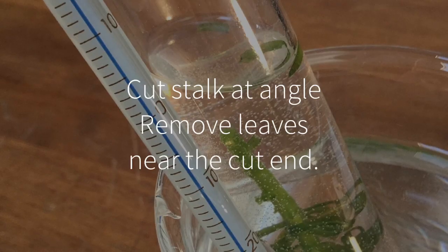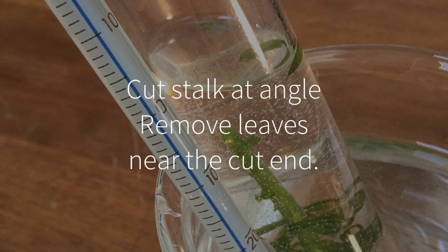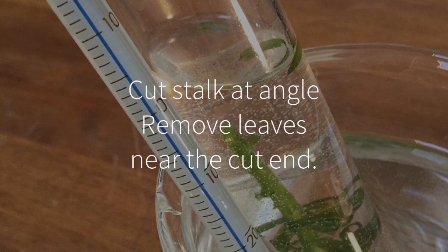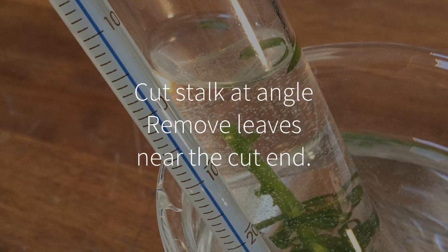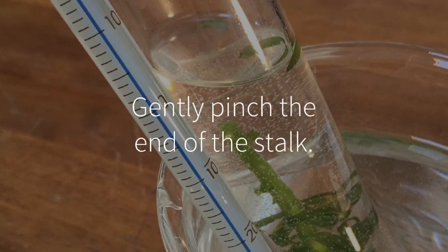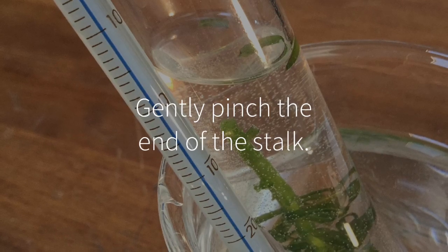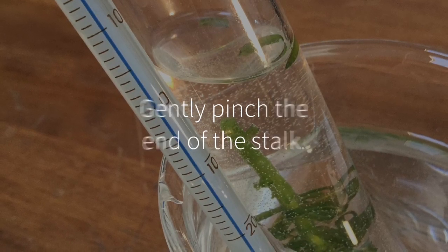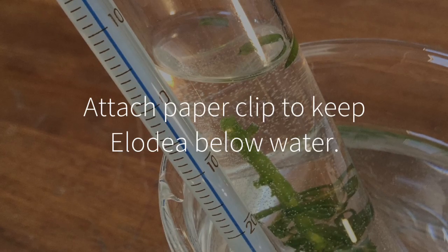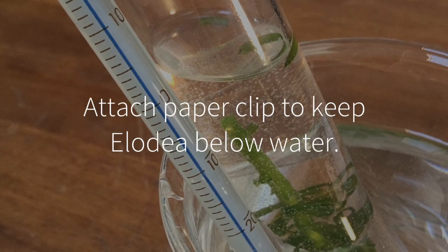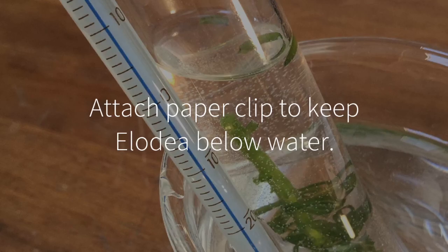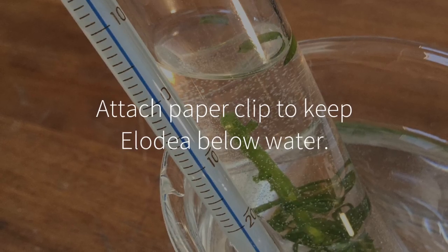Before all of this, we had to prepare the allodea for the practical. We cut a stalk at an angle and removed the leaves near the cut end. To ensure that we could visualize actual bubbles of oxygen being released, the stalk was pinched near the end. To ensure that our stalk remained well below the water level, a paper clip was gently attached to the leafy end just to weigh it down.